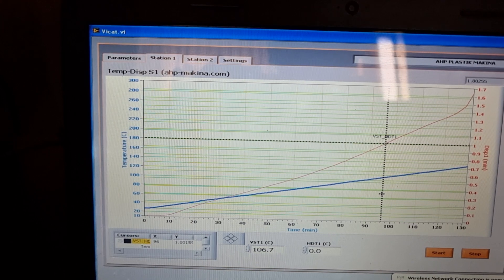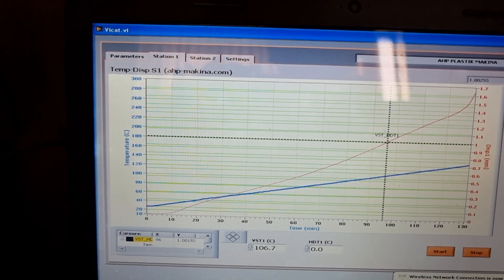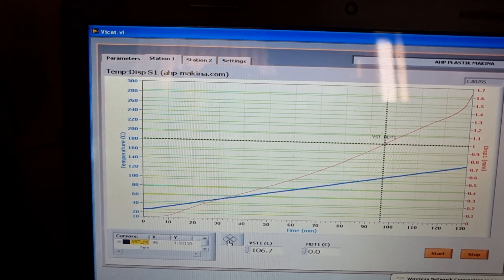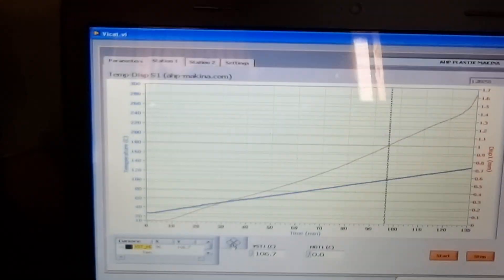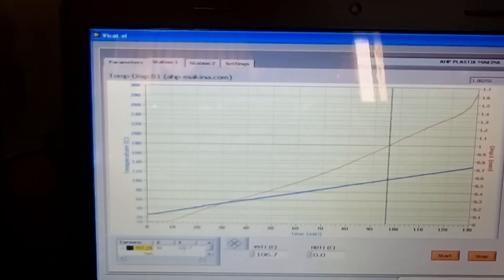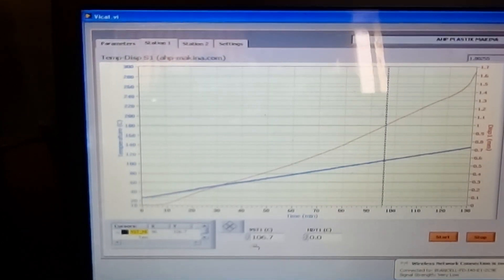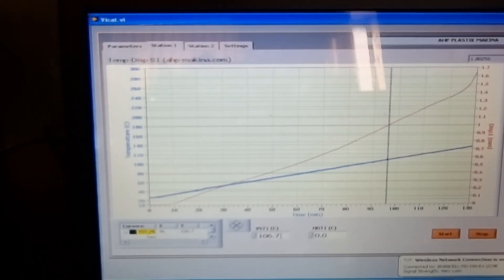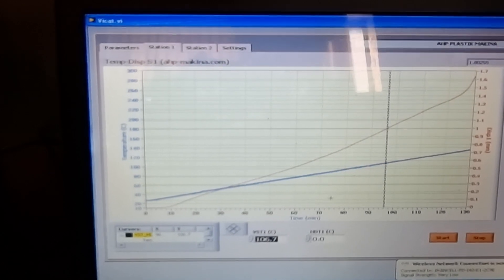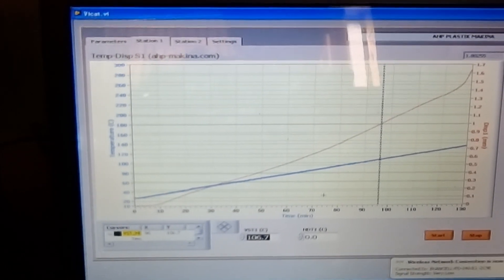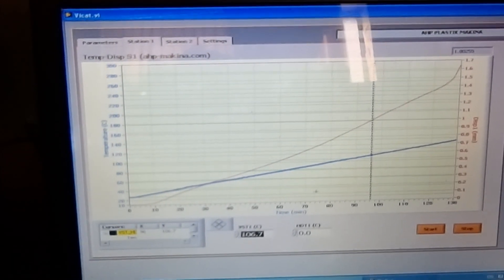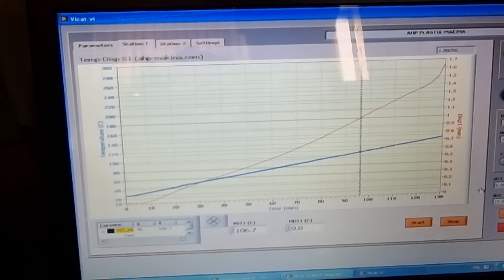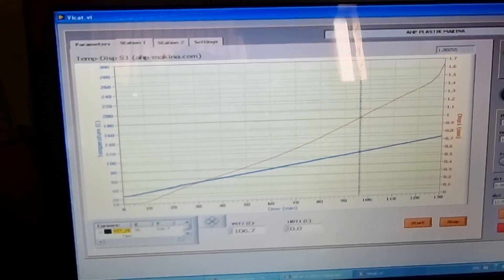Then click on the arrow again, then you will see the temperature here and it's the Vicat softening point of the sample under the test. Then after the test, you can click on report.